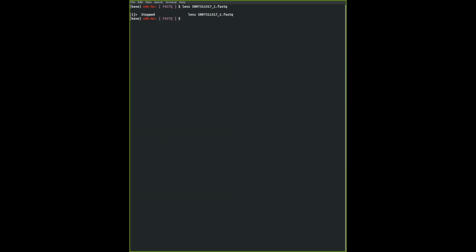So I did Ctrl-Z, so it stopped the whole less program. So if you have a problem with, let's say, it prints out endlessly, and you want to get out from that, you can do Ctrl-Z, so like undo and go back to terminal, right? So that's actually quite convenient. So previewing files, again, not always necessary, but it's nice if you want to have a look at how your files look like, because there are so many sequences you cannot figure out exactly what sequence maps to that. You need tools to help you map anyway.